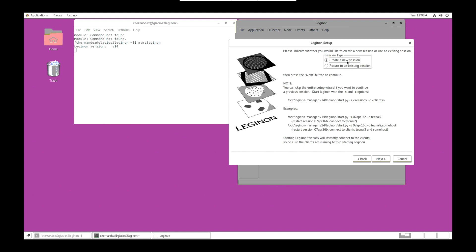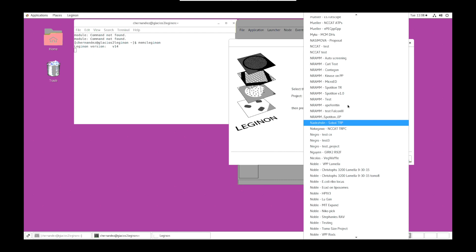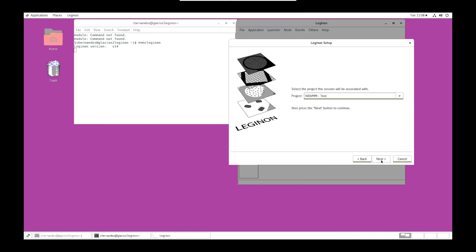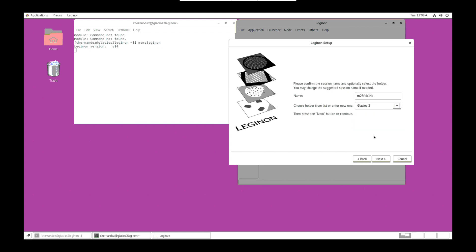We're going to create a new session. Click next. Select the project that you are working on. Next. We'll keep the generated name and we'll change the holder to the respective microscope that we're using. Next.